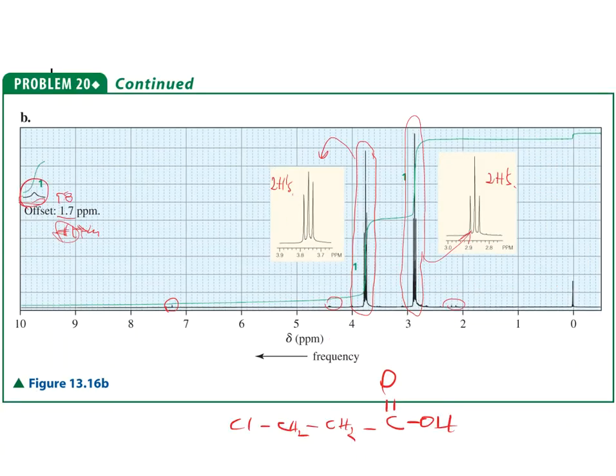In this other one that we did actually first, we see 2 major signals. Which one's which? Well, it looks like this carbon is directly connected to that chlorine, and because that chlorine's electronegative and this one's directly connected to it, then that probably means that this one's going to be harder to flip. So this one is going to be a triplet, and that's probably going to match that one there.